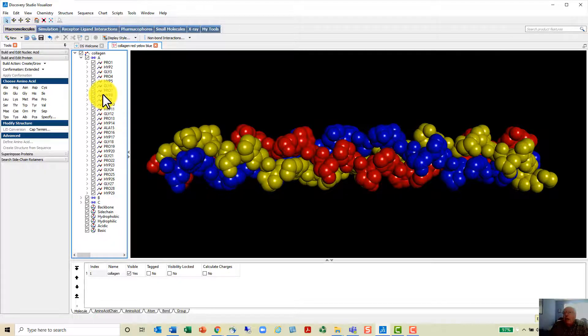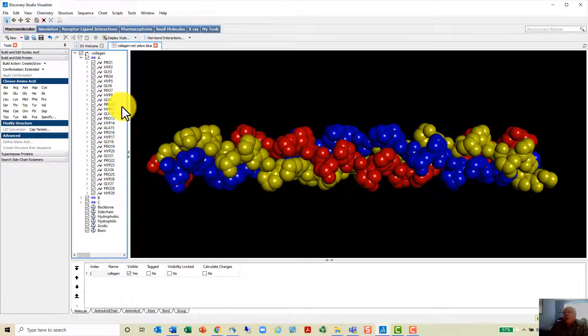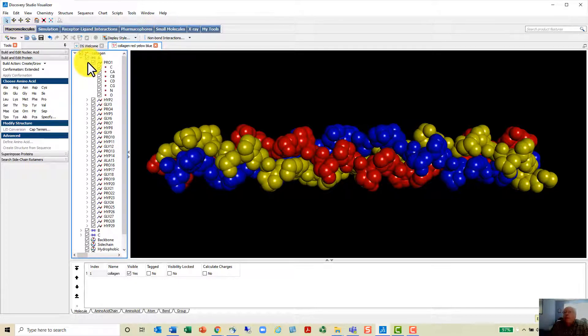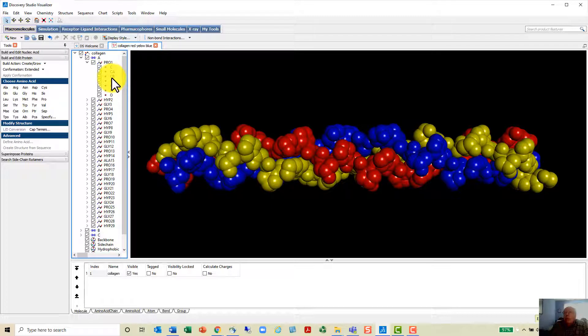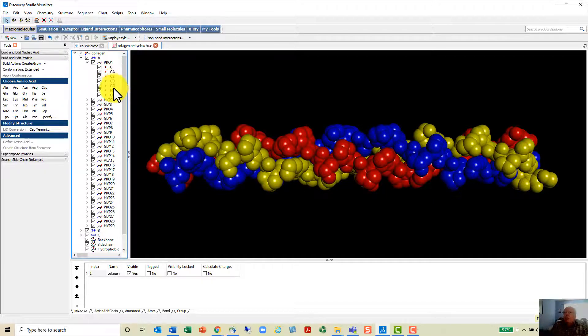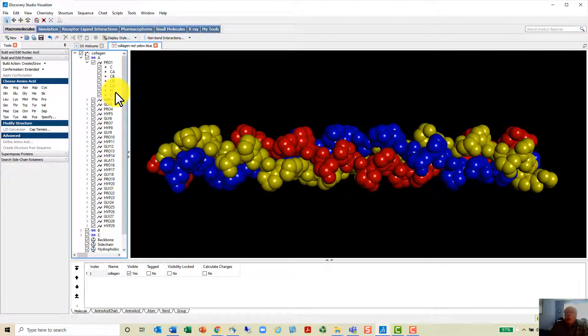It's not a real piece of collagen but it's representative of what collagen looks like. You can even see each individual atom if you would like to. For that proline there's a carbon, a C-alpha carbon, C-beta carbon, C-gamma, and N and O. You see all the bits of the molecule here.